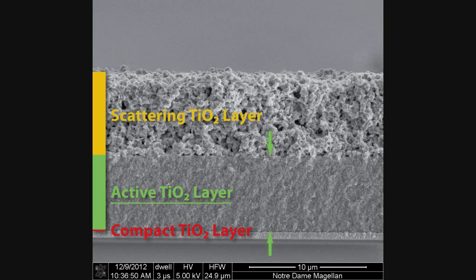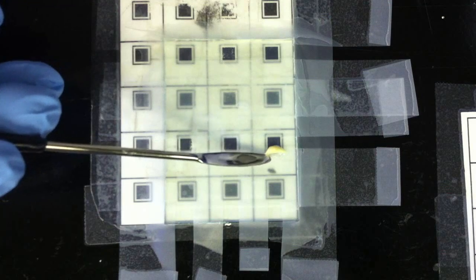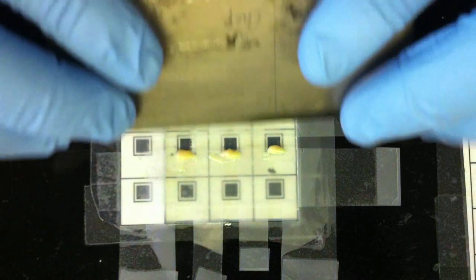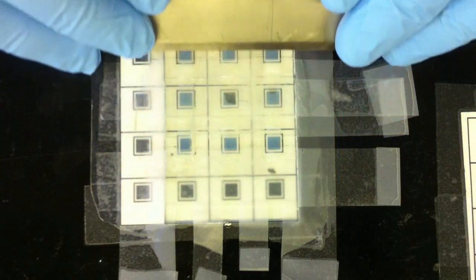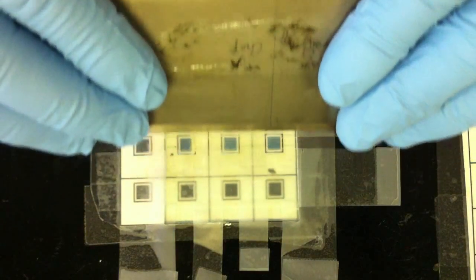Next, we apply the active TiO2 layer to our working electrode. This mesoporous support provides a framework for depositing our quantum dot light absorbers. Active TiO2 areas are marked out using a tape template and cast by a doctor blade technique. Using this simple technique, we can simultaneously prepare multiple active areas.